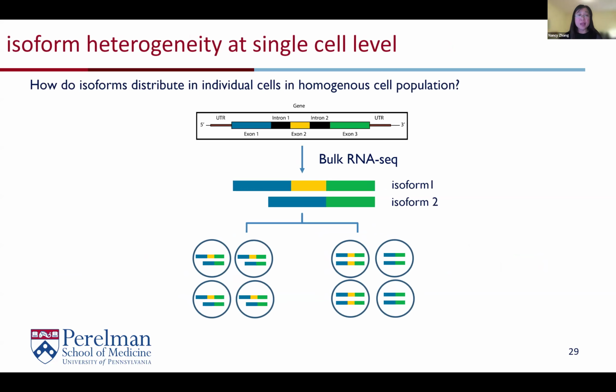So anyway, we're going to characterize this by using this phi, it should be phi sub c. So phi c, there you have a phi parameter for each cell. And that is the ratio of the molecules within that cell that has this yellow exon spliced in.